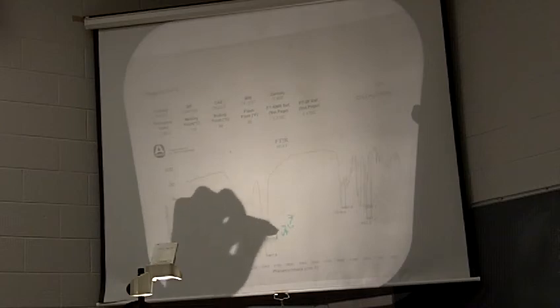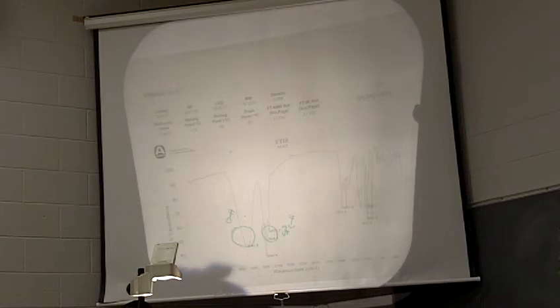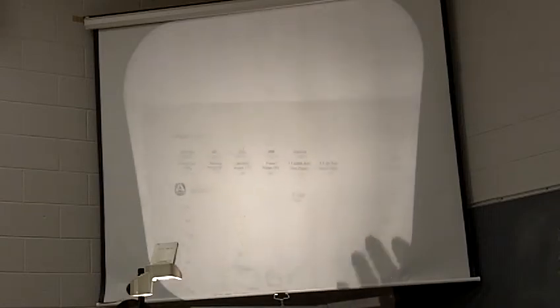So let's go through with another one here. Here's an alcohol, 2-butanol, okay? We've got an OH stretch, we've got an sp3CH stretch, and then we've got our CH bending down here. So with the alcohols, you're going to see most of the information here with then your CH bending down there, all right? And when you get your spectra, you want to write on there sp3CH stretch, OH stretch, CH bending. You want to label the peaks like I've done here, okay?